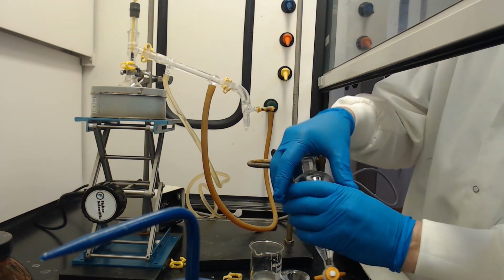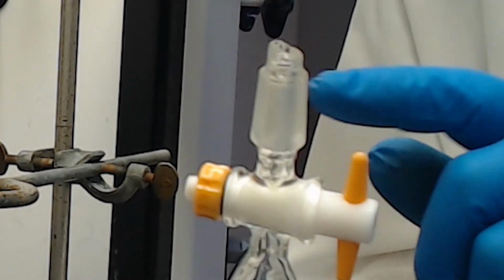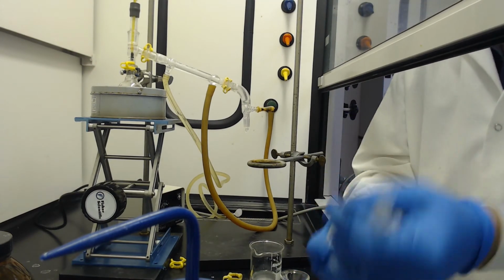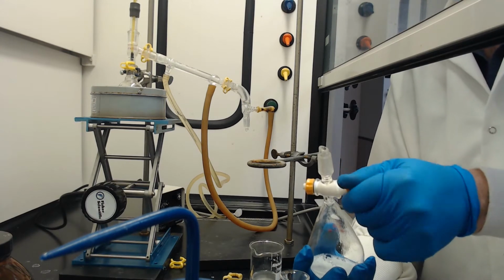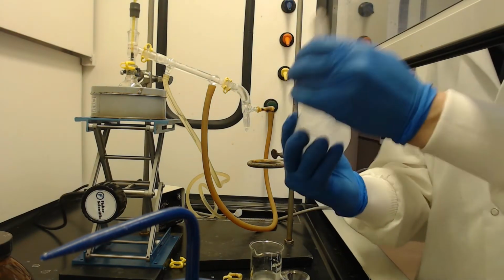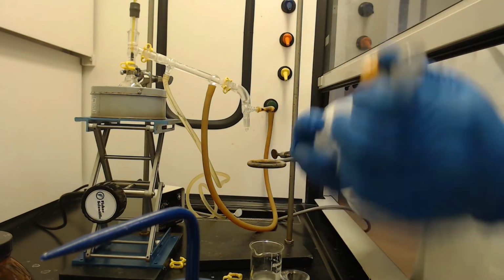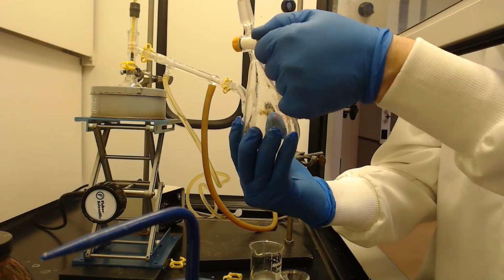I'm going to cap it, I'm going to flip it, and I'm going to open it. And I can see a little bit of gas coming up. You see that little bubble coming up right there? That's the air, the gas evolving out. Could be some CO2 still left in there. And see, this whole time I've got this palm keeping pressure on that to keep it in. All right, we'll give it one more shake. And that's washed out. One more vent.